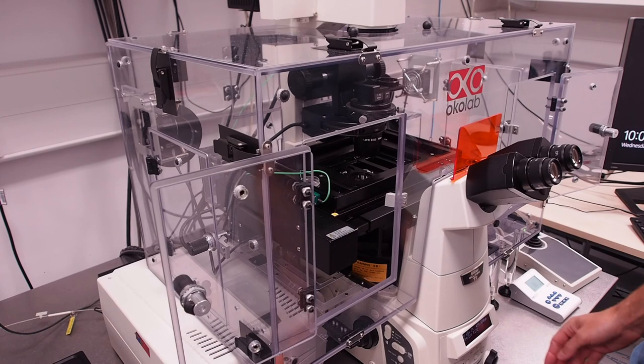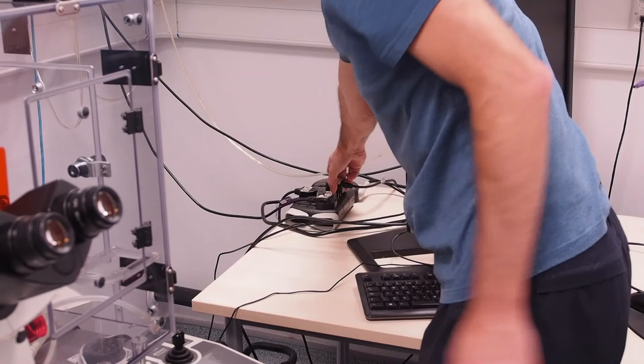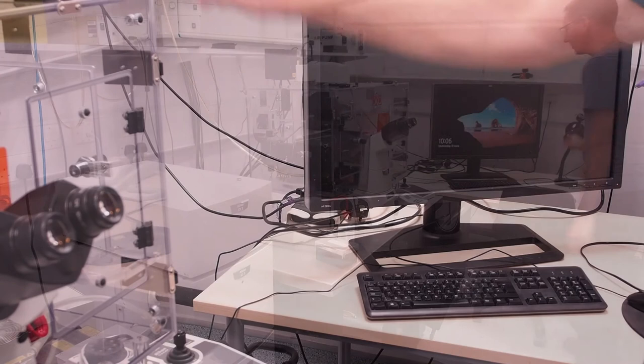Switch off the wall plug labelled LEDs for the epifluorescence lamp. Swing the monitor around to access the surge protected plug bank behind it and unplug the plug that is labelled compressor. Swing the monitor back around and shut down the PC.